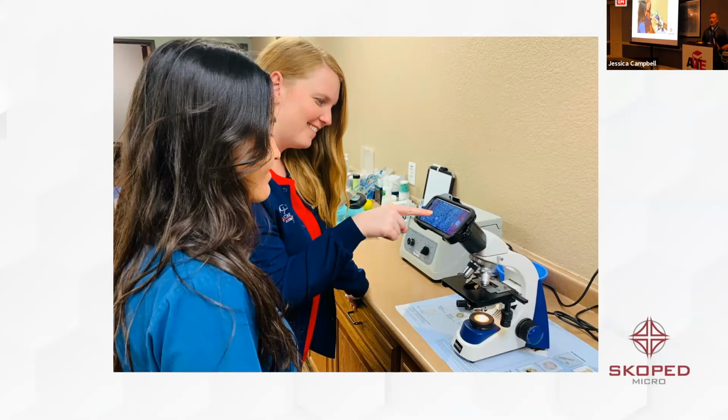In my world, where I don't want any moving parts and I've got a couple minutes, I'll come right back. When I'm like, okay, I've got 3 people waiting on me, I don't want to adjust anything. The fact that mine, I just snap it on, literally in 2 seconds, I can take my pictures. And so I like the custom cases. Costs, they're the same. Actually, these cost more to make. And so the custom, I think, is the way. And we'll get more into that in a second.